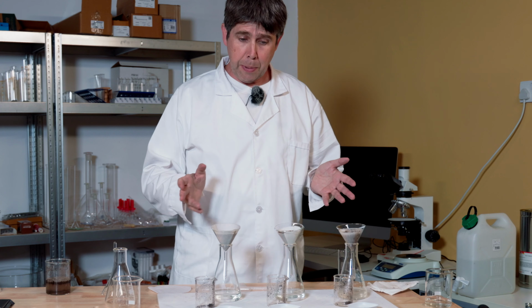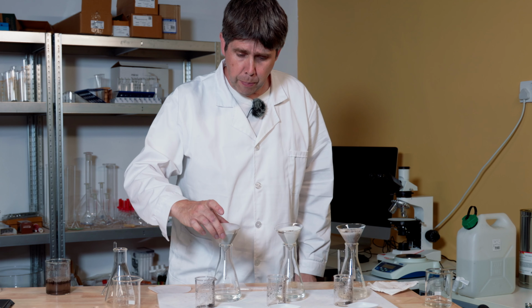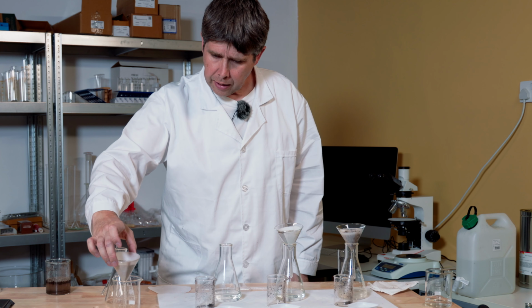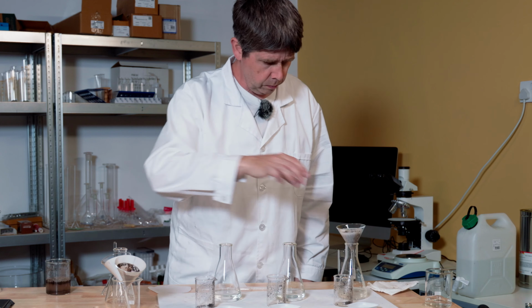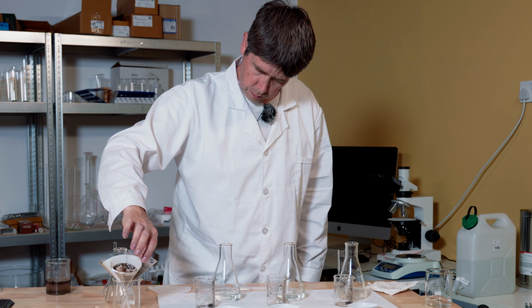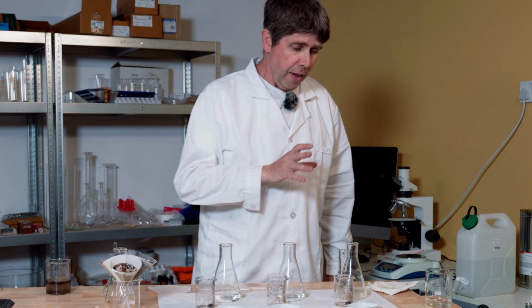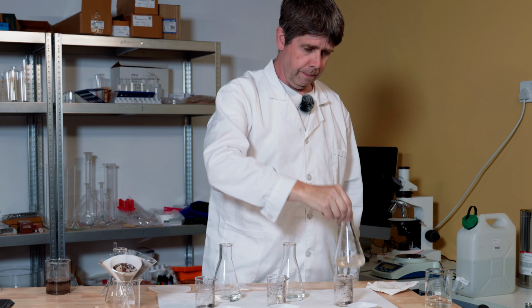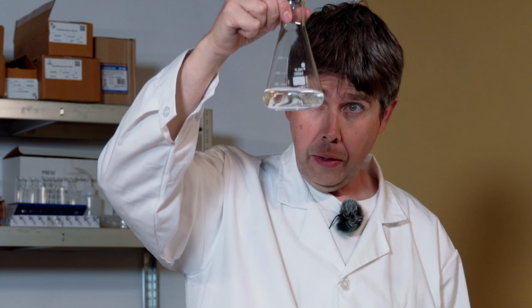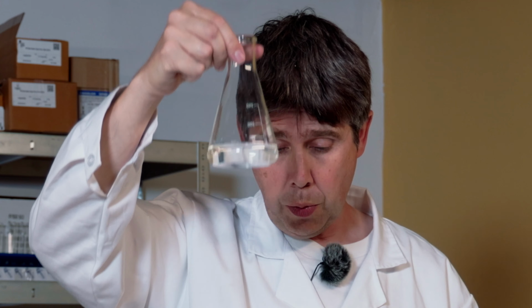All 3 filter papers have now finished filtering through 80 centimetres cubed of liquid. I'm going to remove the funnels and just store them over here. And then we can have a look at the solutions that we've been left with. Now, these 3 filtrates here, I can see by eye that that one is slightly cloudy. This one looks clear, and so does this one.